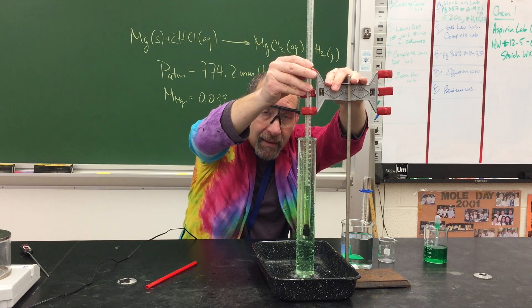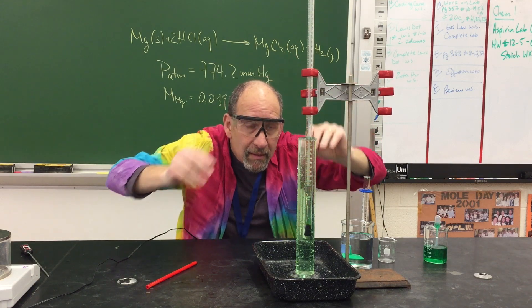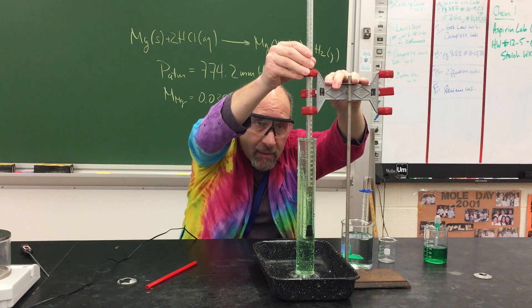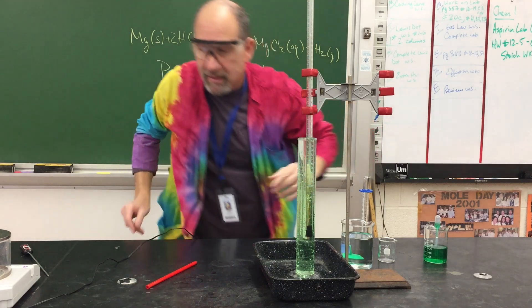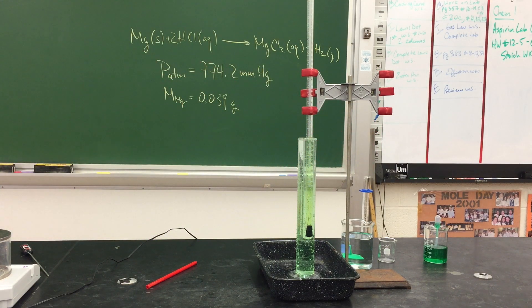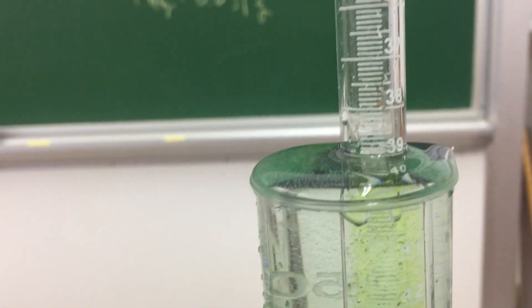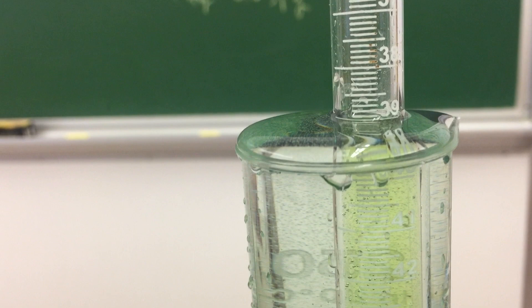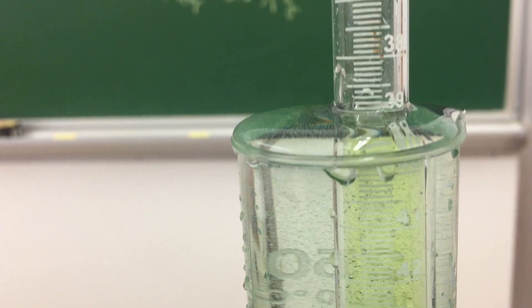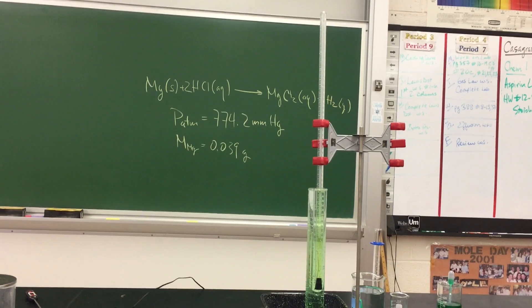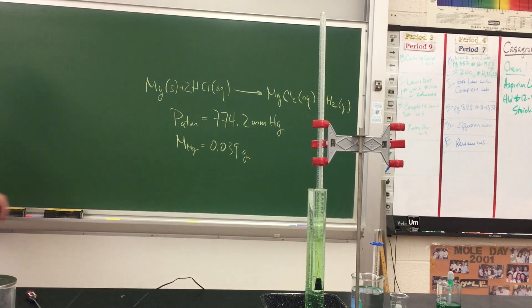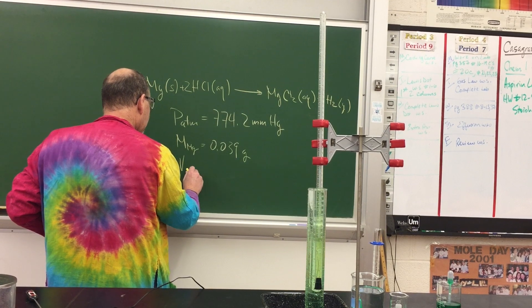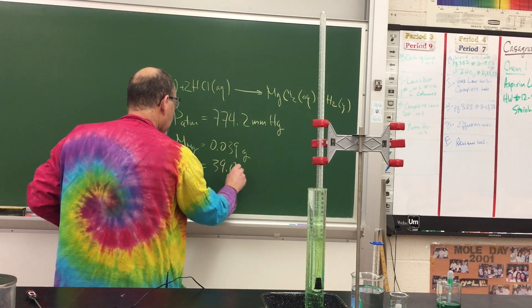I'll bring the camera up close so you can see the volume. It's tricky because I'm working with two meniscuses here. You can see the Udometer reads 36, 37, 38 — and I'm going to say that looks like it's right at 39.0 milliliters. So the volume of the gas in the Udometer is 39.0 mL. Watch those sig figs. That's not quite our last measurement — we have one more to go.